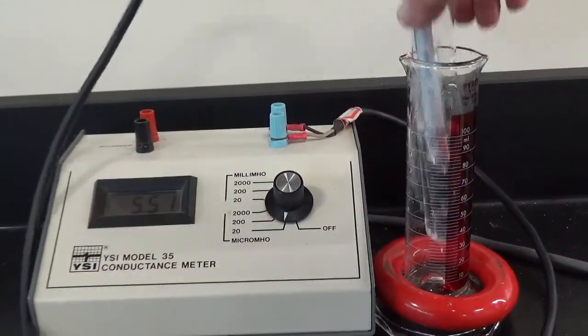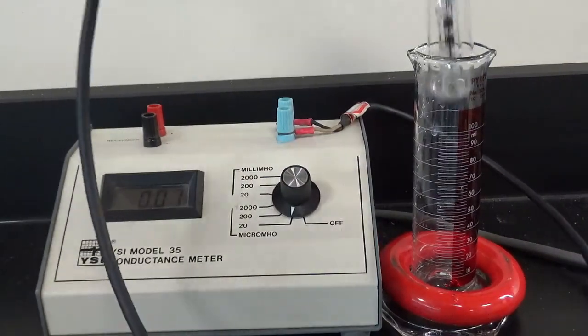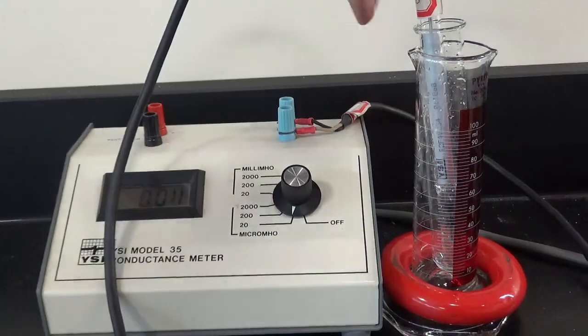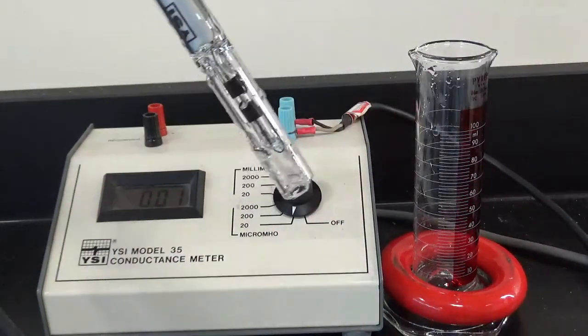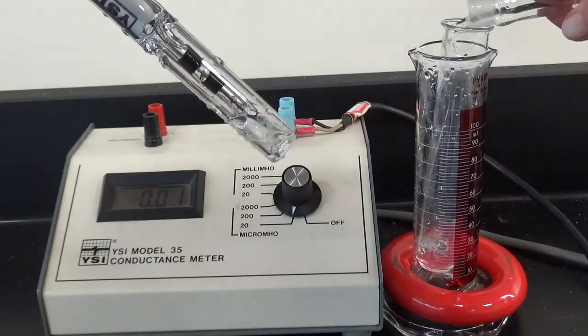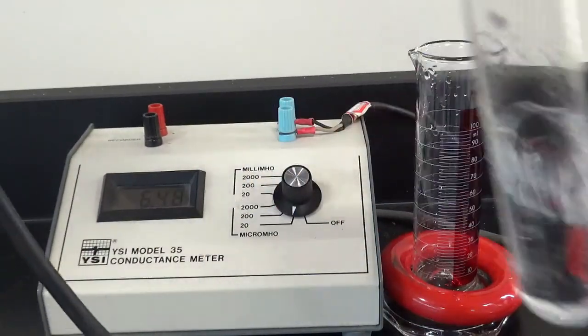All right, now, what you might notice that I've done here is I started with the most dilute CTAB solution. Solution 1 didn't have any CTAB in it. I don't have to rinse too thoroughly in this because I'm actually adding a solution with more ions as I go along. So once again, I'm going to rinse it once, making a few bubbles there. Oh, I probably should have rinsed the conductivity cell as well. Well, I'll do it again. There we go.